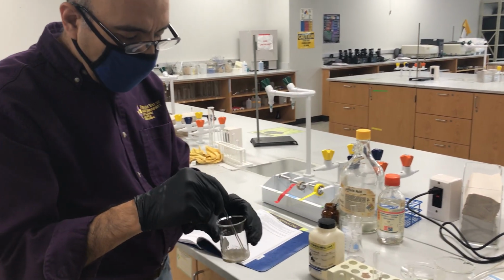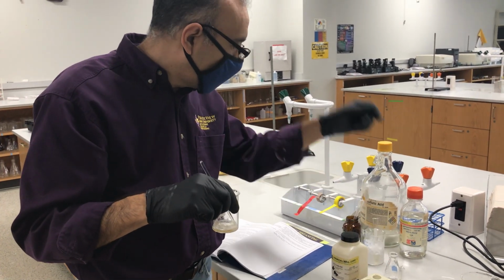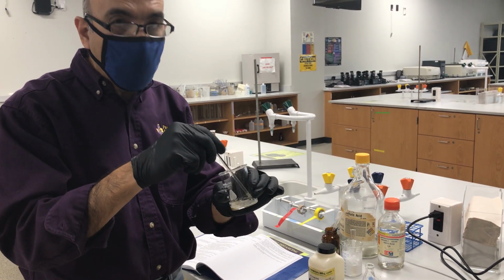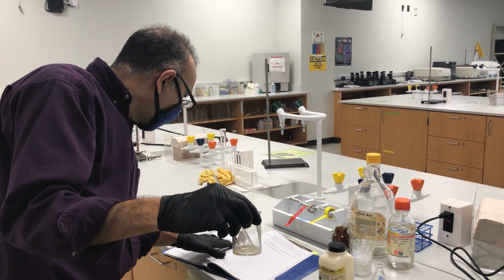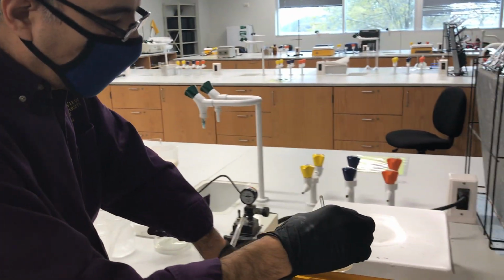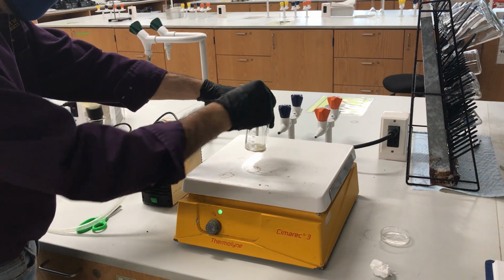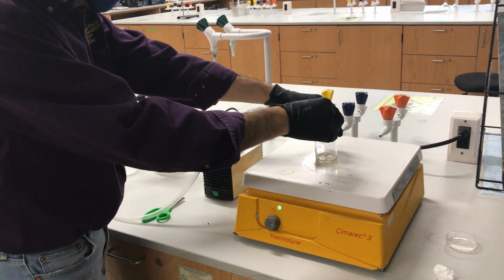You can do this reaction in a conical flask, you can do it in a beaker, or even in a tube, which should be okay. For the sake of making it easy for you guys to see, I will do it in the beaker here. They mention that after we do this, we just have to heat it a little bit. We have a hot plate here. The reason I'm going to heat it is just to make it soluble. As you can see here, it is not soluble, so I'm going to make sure it is soluble.